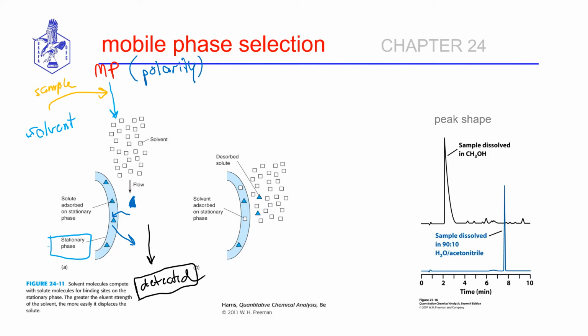So it's a delicate little balance in the relative polarity of the mobile phase and the stationary phase. And we will talk about how to approach that selection in the slides that come.